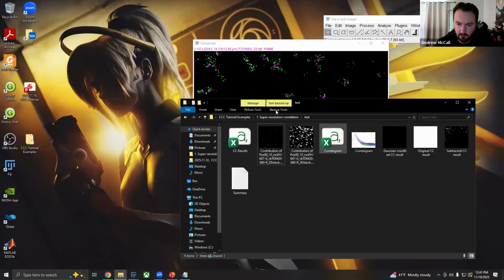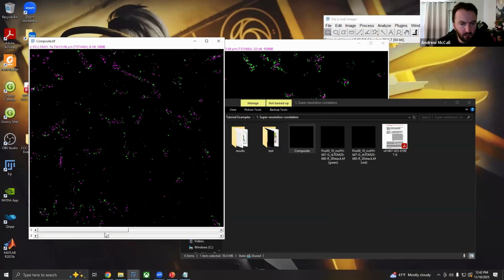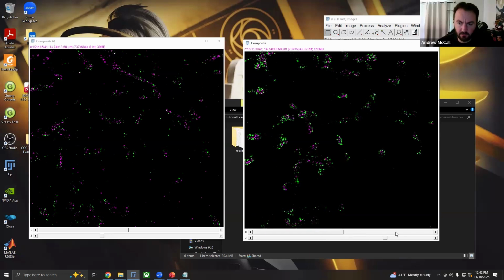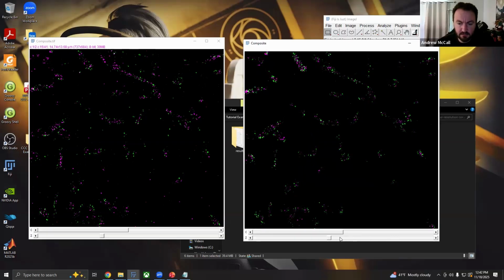So you can see in the original image here, if I open that up, that we have, close that for a second, some data kind of out here, and all of that is now missing from our contribution image. So we're only showing the data really that is correlating, right, within that spatial correlation range. And it looks like we have just kind of a couple there, which is why we have some out there. But that's the basic idea.